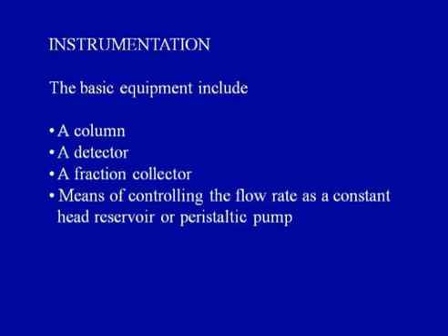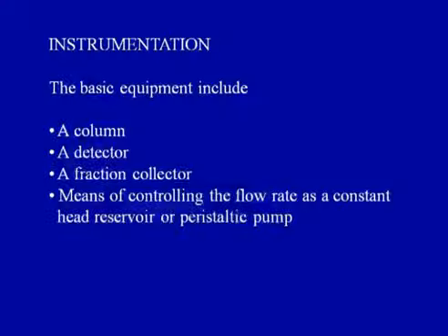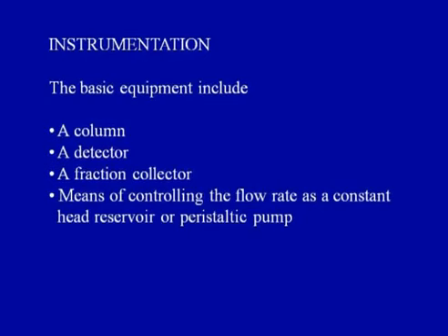You require a detector so that you can follow the peaks which are coming and see the purification visually. Then you require a fraction collector to collect those fractions or different peaks separately. Then the flow rate has to be controlled. You can have a constant head reservoir, but that is not very suitable. What you require is a pumping system. It could be a peristaltic pump for low pressure, or for high pressure it could be a constant displacement or other pump.